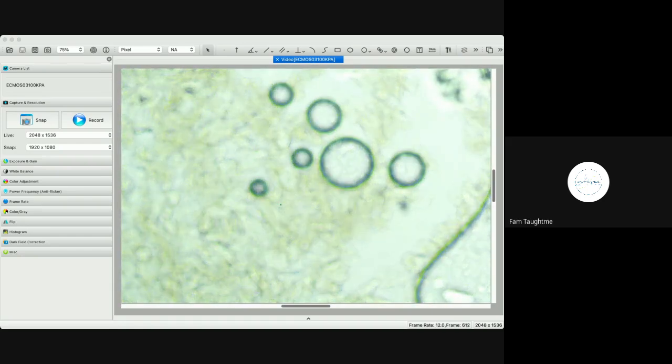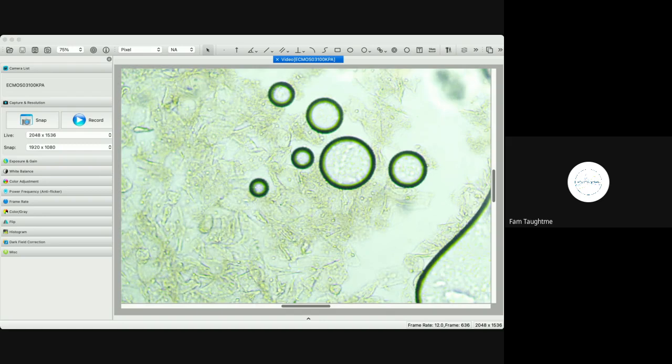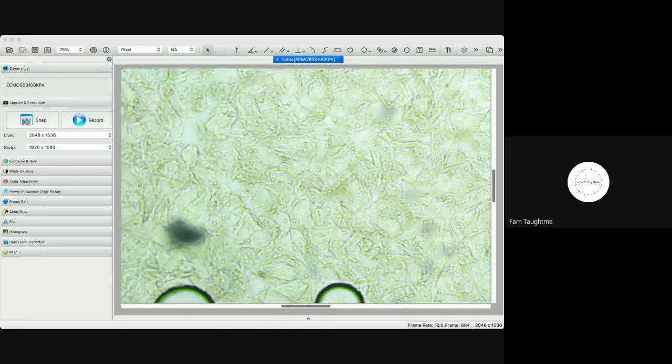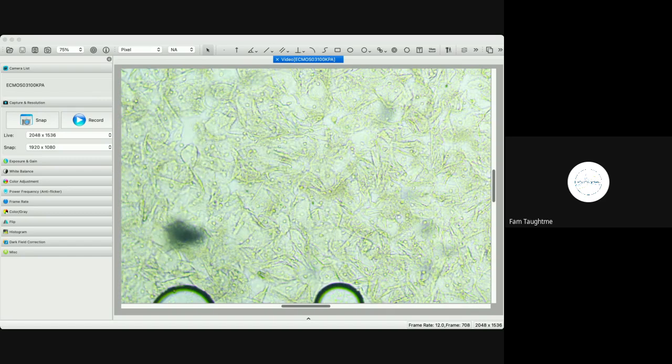Yeah, so these right here look like your typical epithelial cells found in the vaginal canal, like what people call vaginal discharge. Just the literal side cells of your vaginal walls. That's what a lot of the sample will be, because I'm not taking the observation from my cervical crypts.